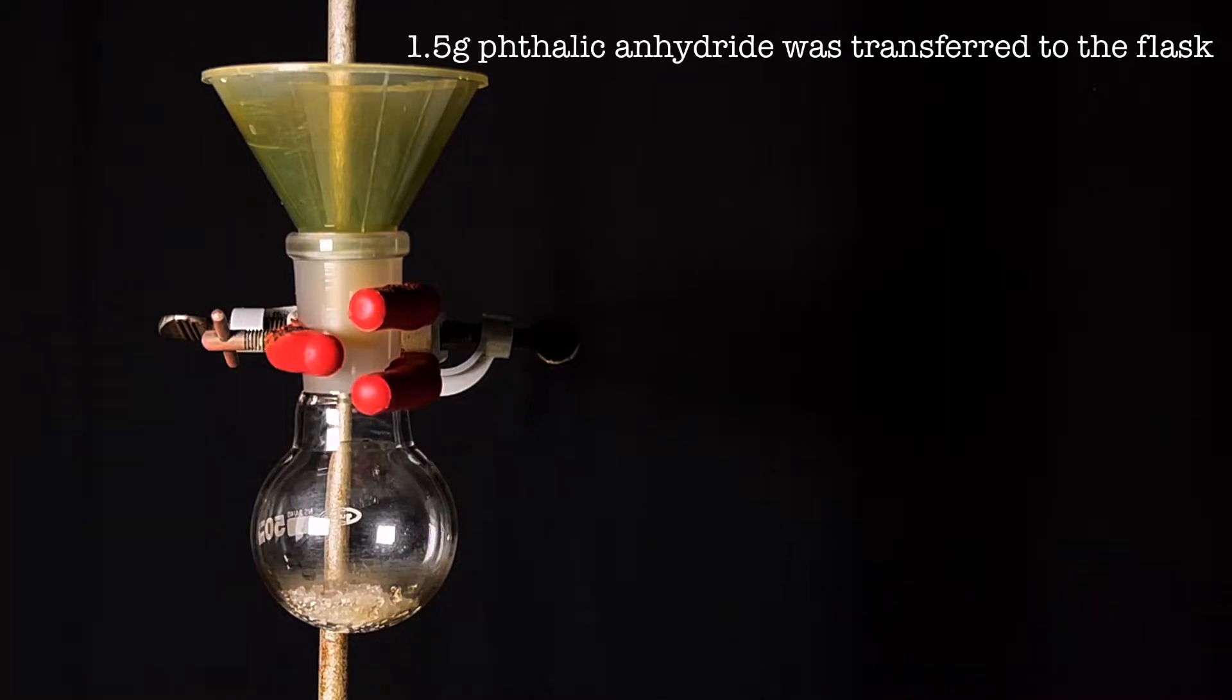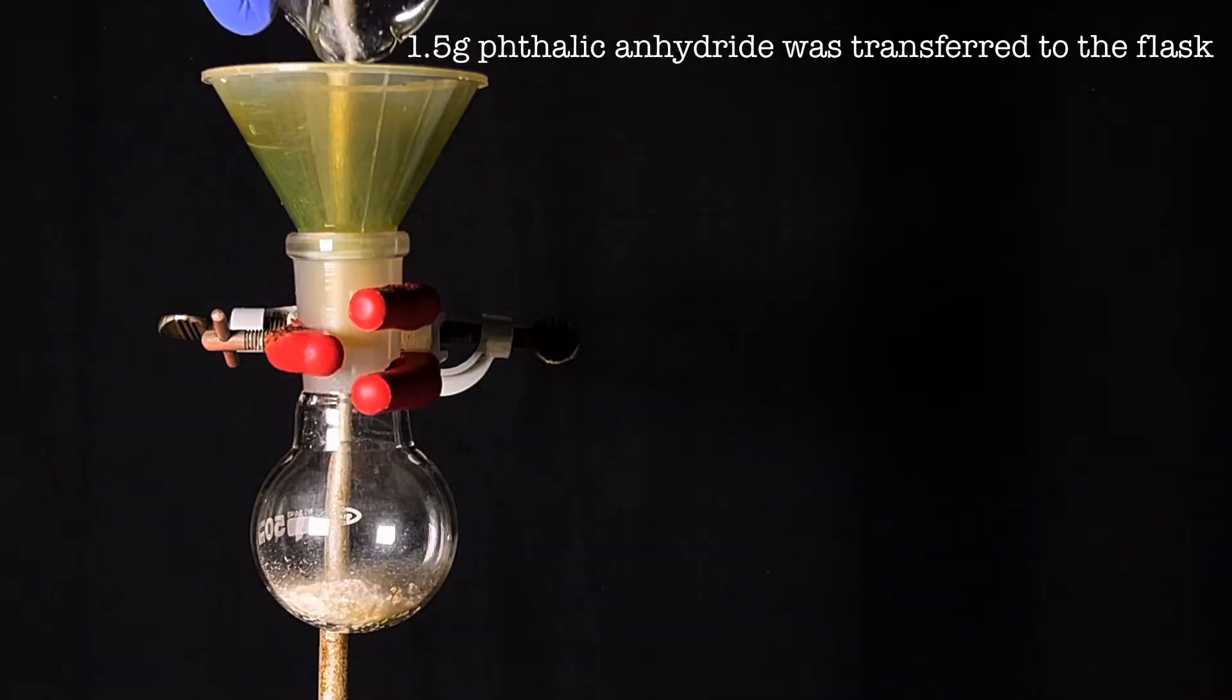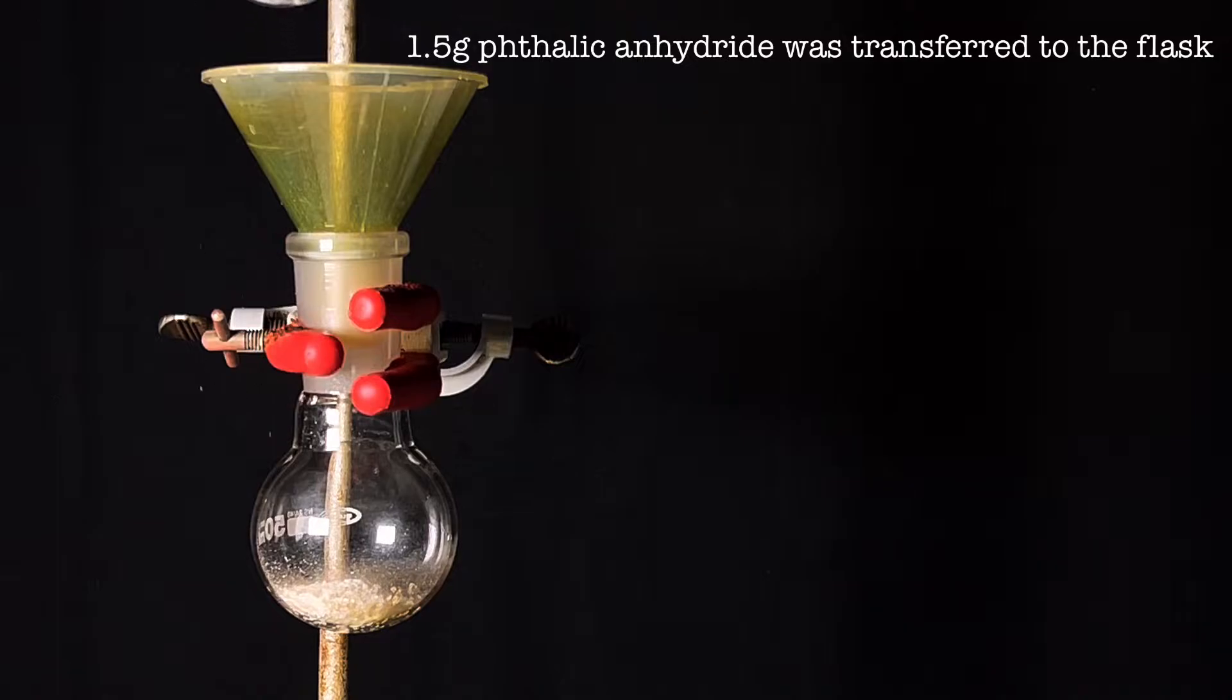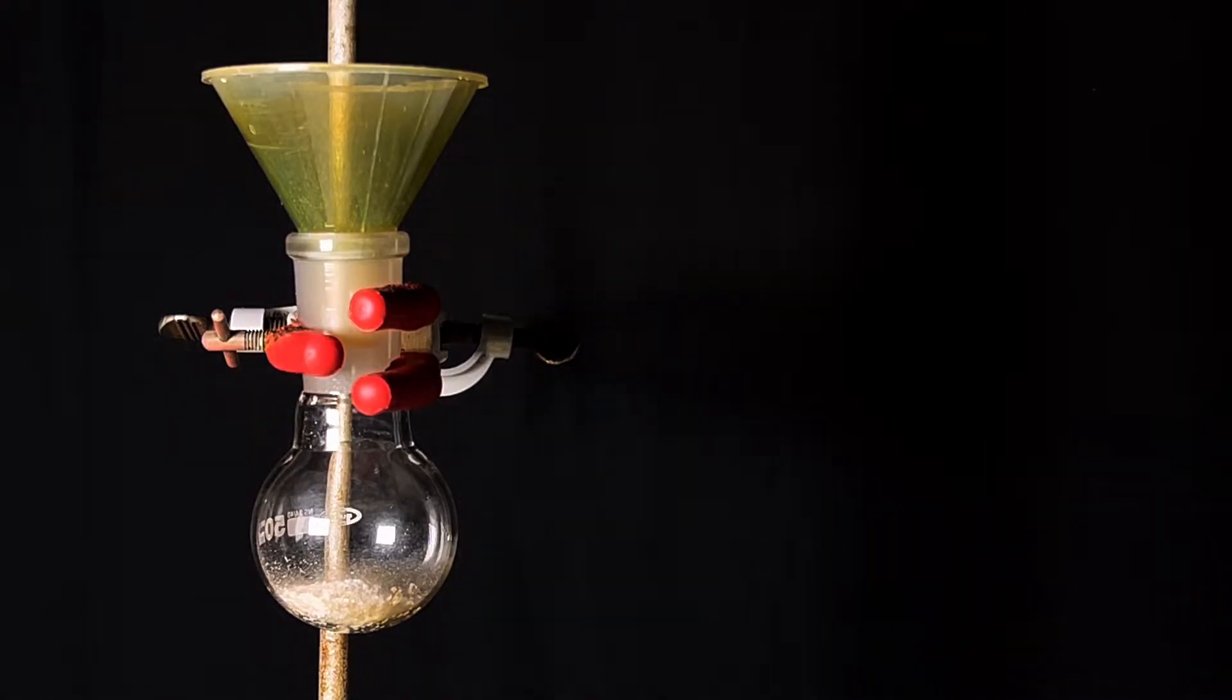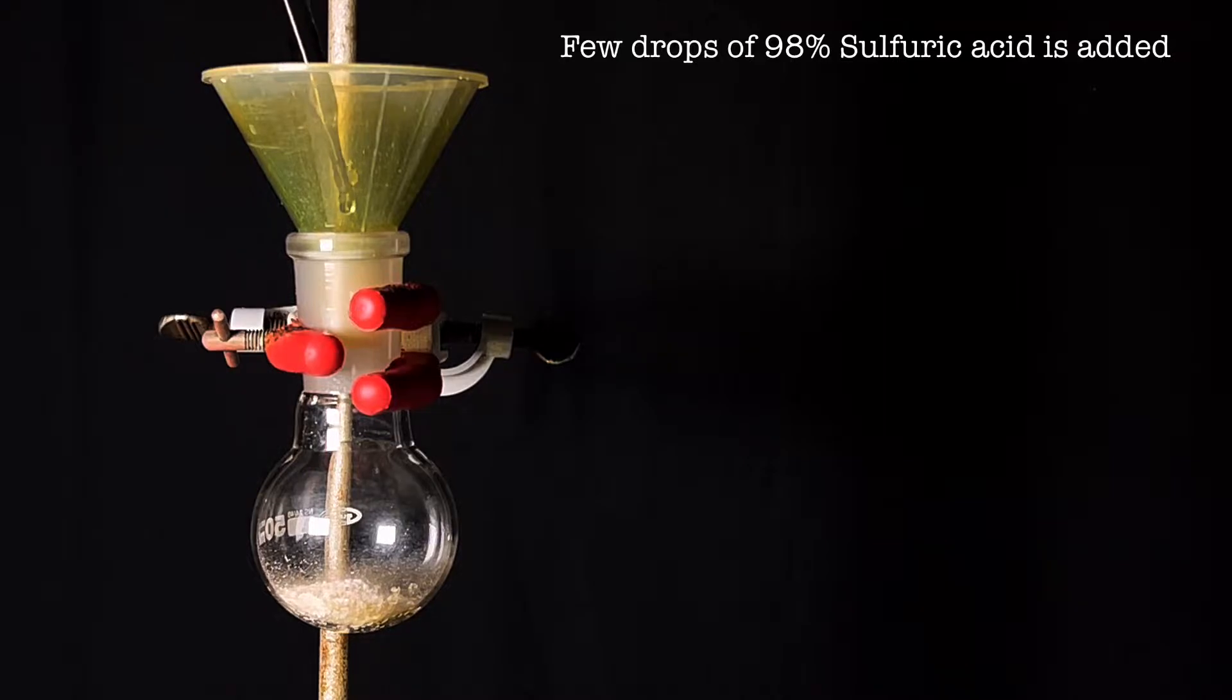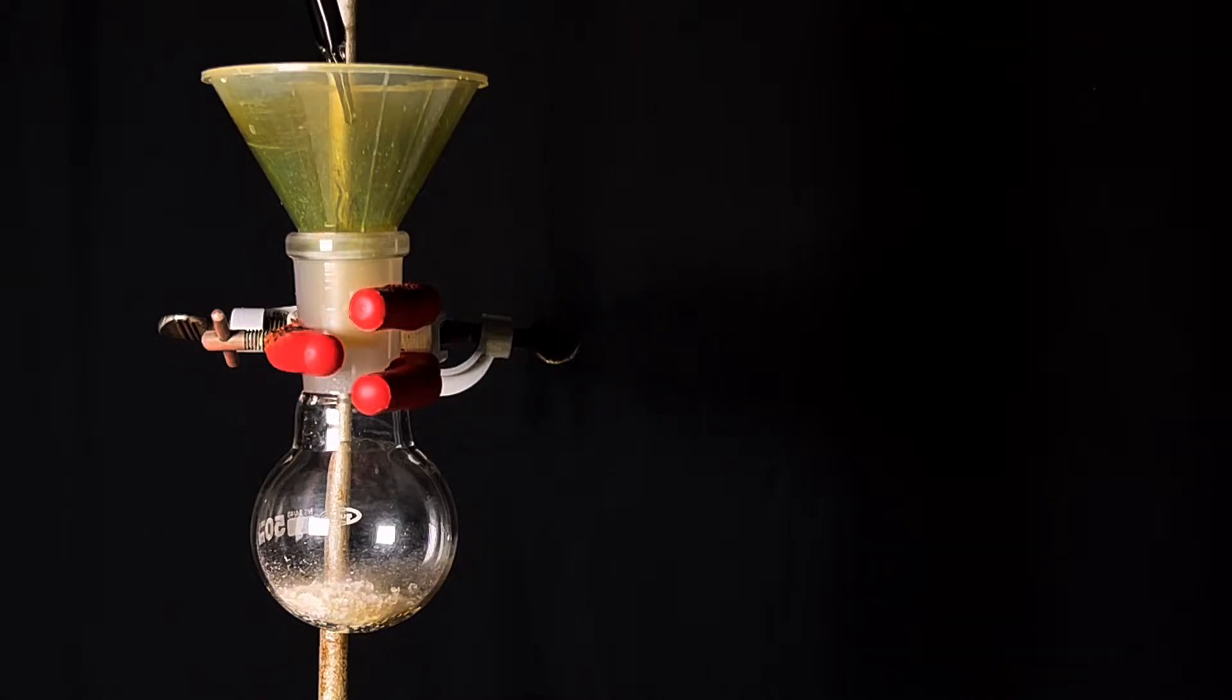Next, 1.5 grams of phthalic anhydride which was pulverized into a fine powder was added on top of the phenol. 3 to 4 drops of concentrated 98% sulfuric acid was added to the flask. Do not add too much sulfuric acid as that would char the reaction mixture and we will be left with carbon.